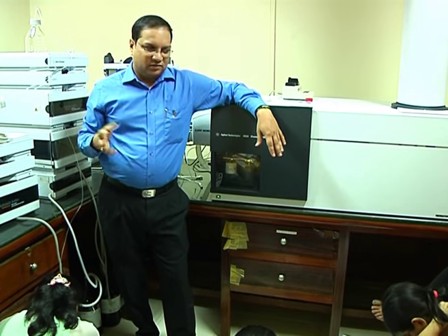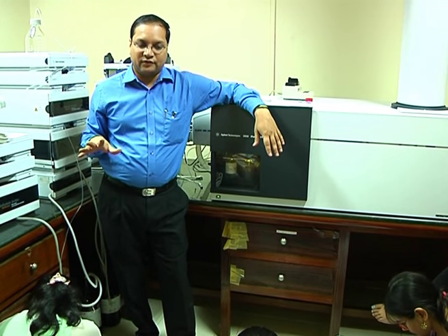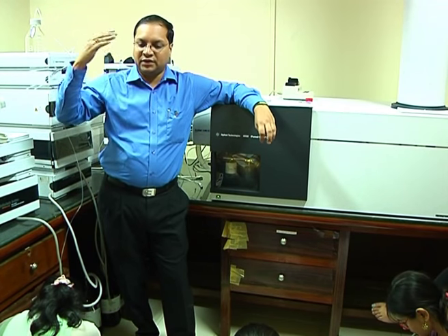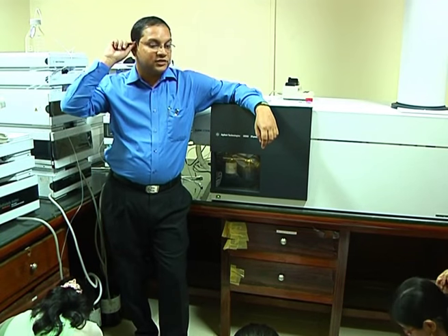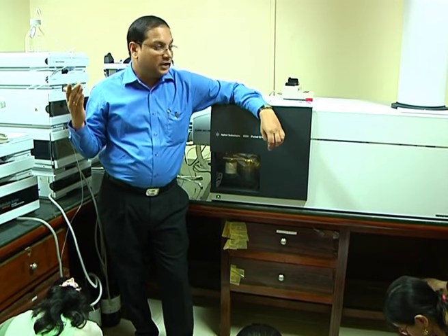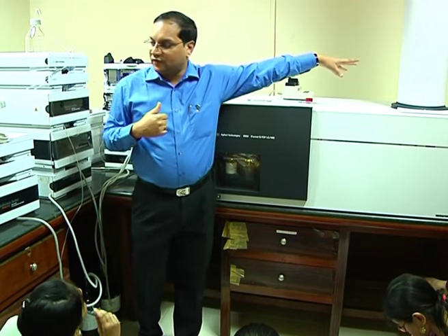That is one way. Nowadays, mostly no one is using that PMF approach, for the simple reason that redundancy will rise. Based on only accurate mass might not be sufficient. You may have to trigger an event. Then comes the other approach, which is called data dependent. In the data dependent approach, we take advantage of both the analyzers, quadrupole as well as time of flight.